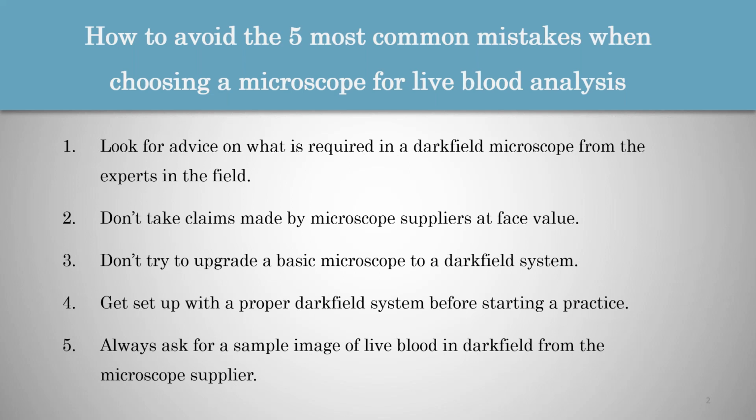That's very interesting. And I suppose that practitioners that are interested in buying a microscope for live blood analysis don't really have a background in microscopy, because of the amount of information that they typically need to work through to understand what is needed in a live blood analysis microscope. Many people end up buying a microscope that actually isn't suitable. And that's the problem. Yeah, it's a huge pitfall, and we've seen it many times as well.